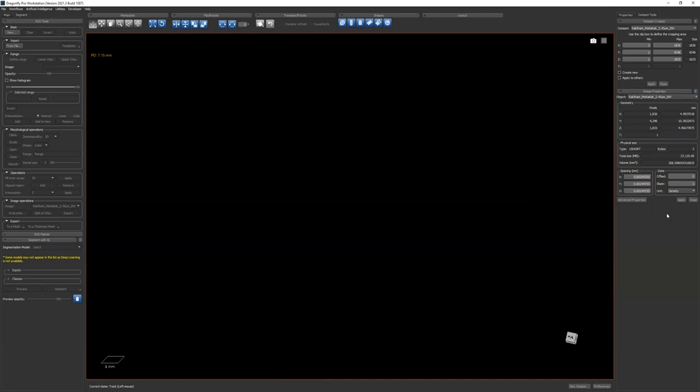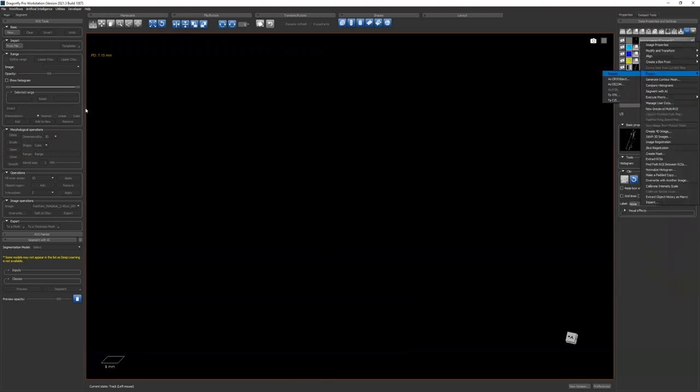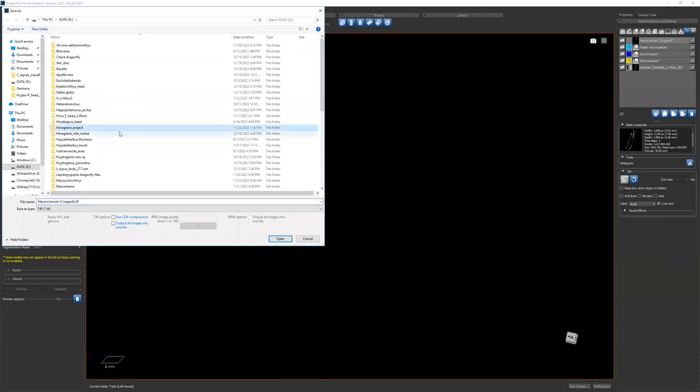Ours is 2.4, which is 2.4 microns, and that's the resolution we got when we scanned. So always name your files with what it is, ideally the fish it is, the structure it is, and the resolution.